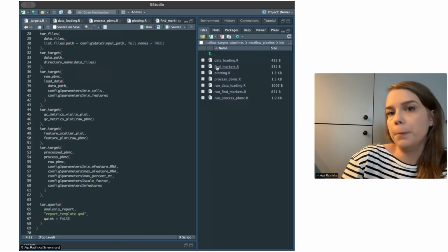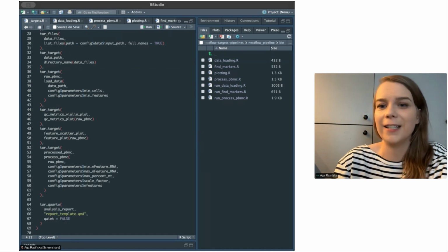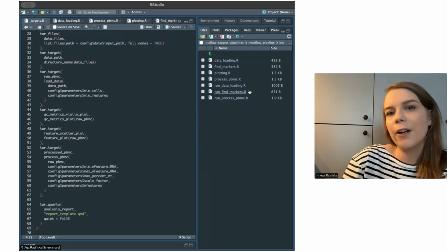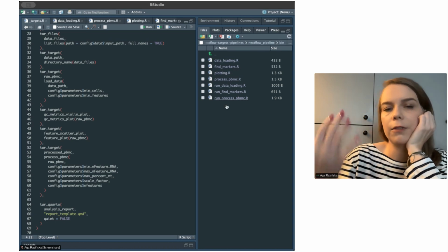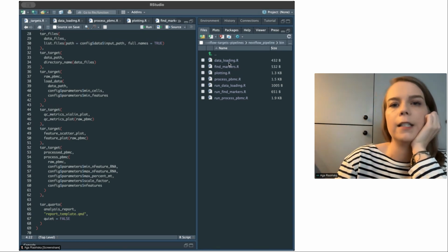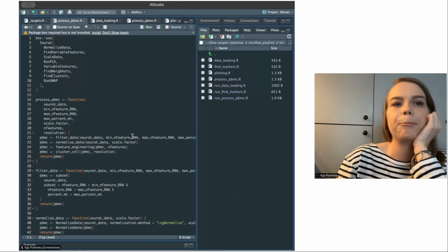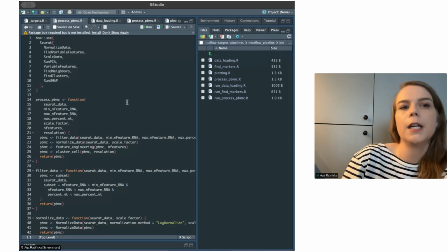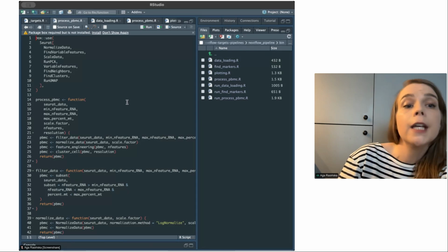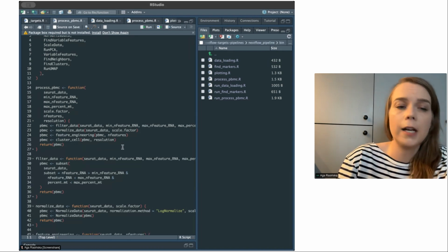Moreover, the scripts that I'm using, scripts that I would be using anyway to make this analysis go, are stored in the bin with R, and as you can see, they are matched with the steps of the analysis, so data loading, then the main process, PBMC data, with all the Seurat functions that I will be using, not only filtering, but feature engineering and clustering cells.